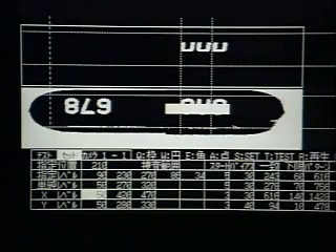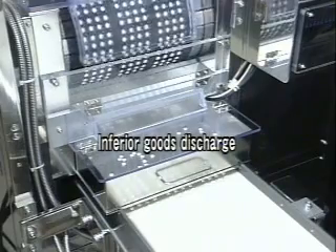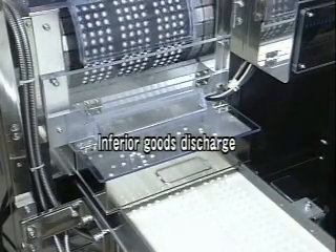If a product is defective either with respect to the printing, the content or the tablet's surface, the defective tablet will be removed into the special box and the other good quality tablets will be picked up by the special belt.